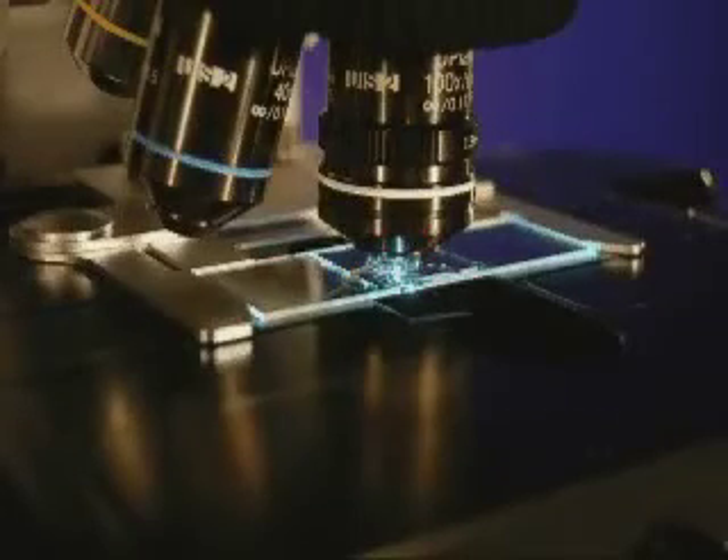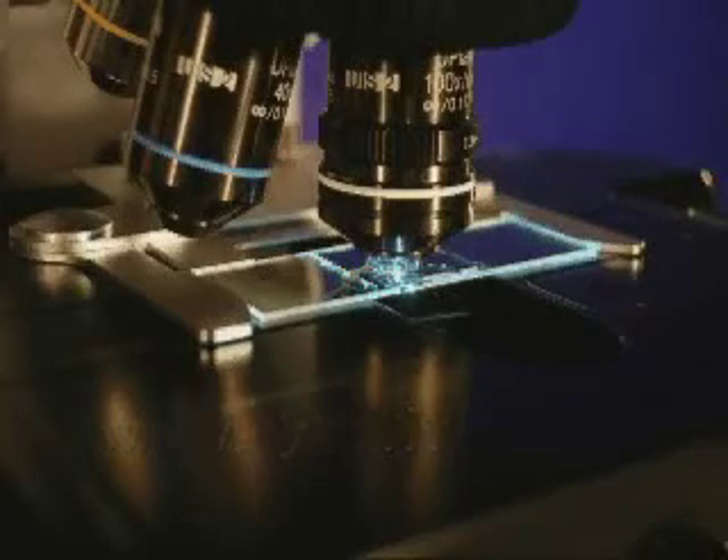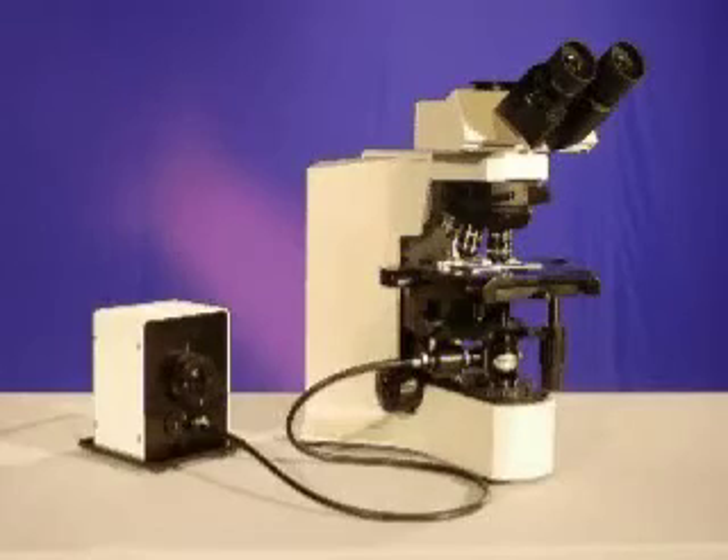After you have finished viewing this video, it would be advantageous to go to the CytoViva website to review the instructional video that demonstrates how to set up and align the CytoViva adapter. Alignment for this system should be conducted with the fluorescence modulator in the non-filtered mode.